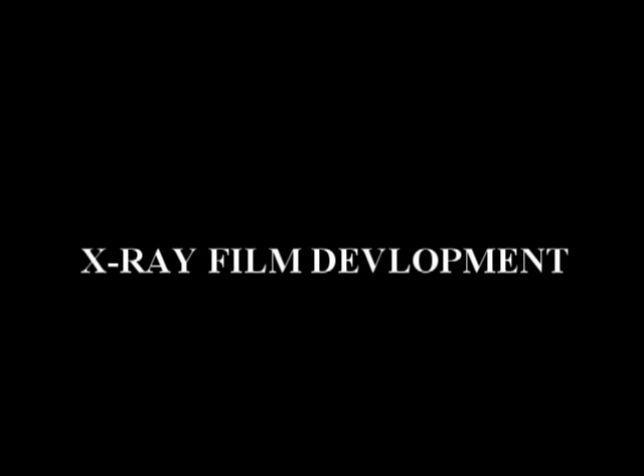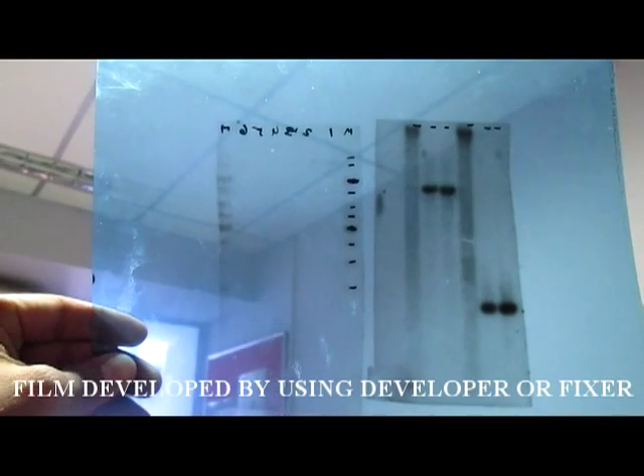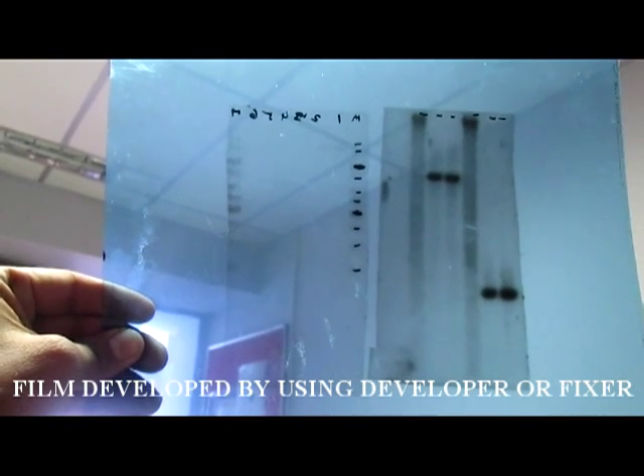For the x-ray film development, never expose the x-ray film or x-ray film package to light. The bands on the film show the positive results.